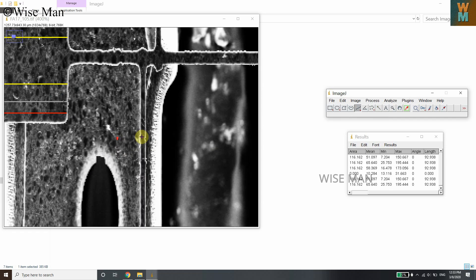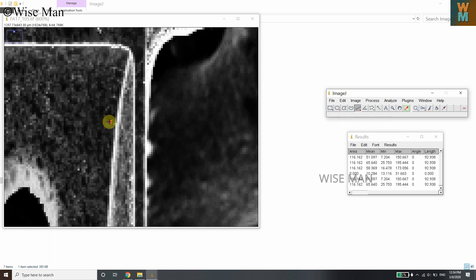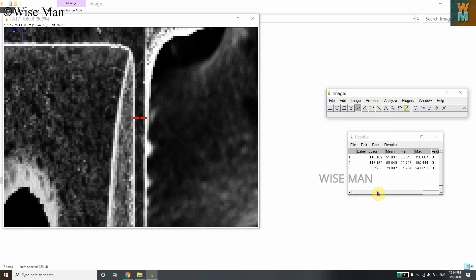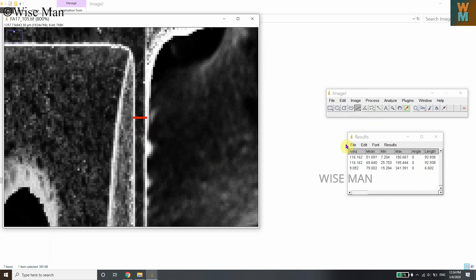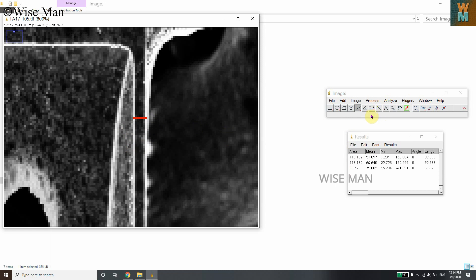You can continue measuring additional distances — drag to draw a line, go to Analyze > Measure, and the third measurement gives 6.6 micrometers. An important thing to remember: after drawing each line, always go to Analyze > Measure; otherwise the measurement won't be recorded in the Results box.